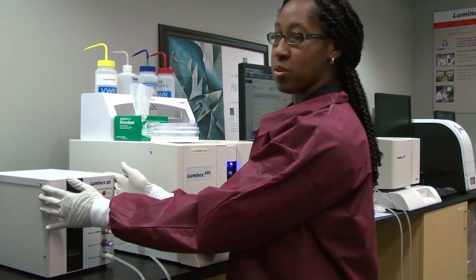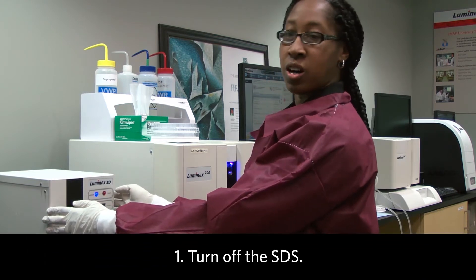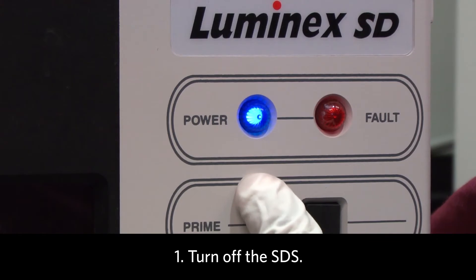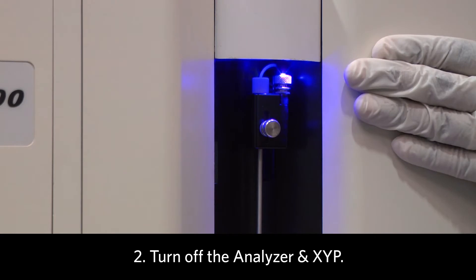First, since we will be totally removing the SDS unit, you want to make sure you turn it off. Also, turn off your analyzer and the XYP.